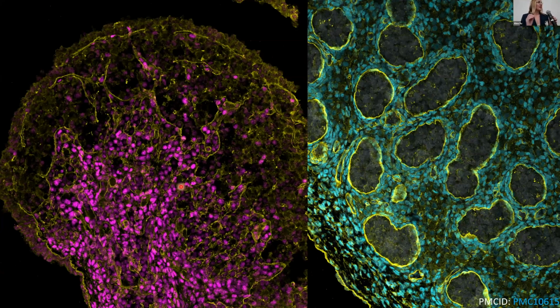So that event of sex determination drives an extremely large morphological change in the bipotential gonad to form either the ovary or the testis. And so what you're looking at here in pink are the NR2F2 stromal cells that are coming in from the mesonephros into the bipotential gonad. What's not stained here in these gaps would be the FOXL2 granulosa cells and the germline cells, so they're forming large nests.